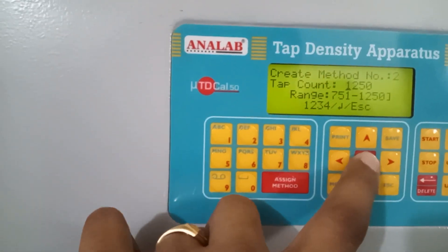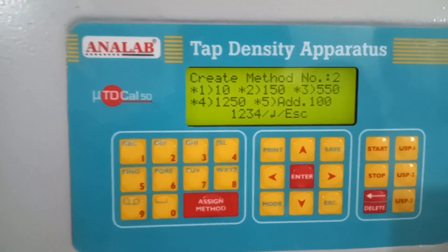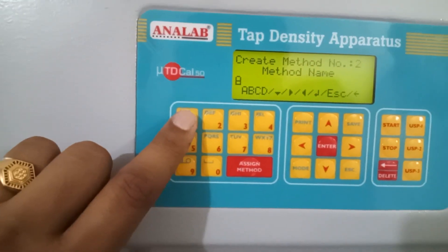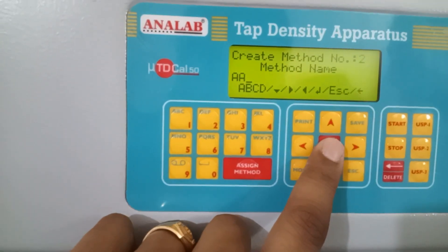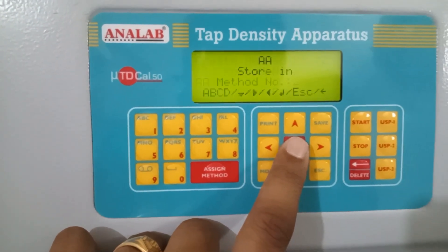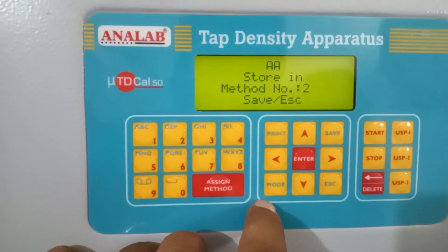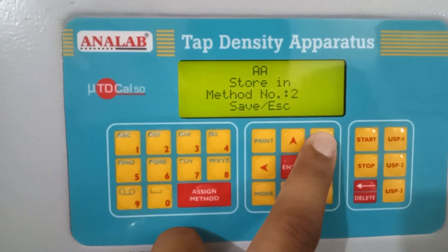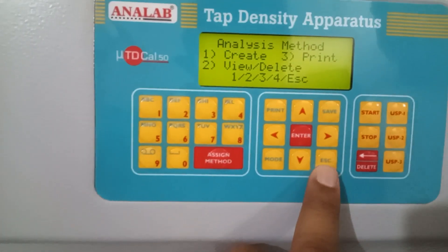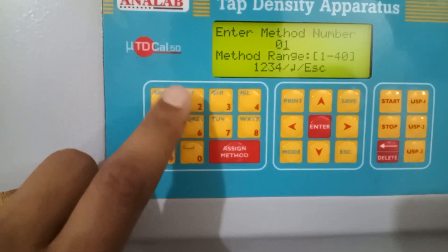I will also select the remaining four tab options. As you can see, the star marks indicate all the type options are selected. If I press enter now, then it will ask for the method name. I have written 'AA' as the method name — it can be an alphanumeric name. I will press enter. This will show the option available to save the method: the name of method stored in method number 2. If we need to save it, we can press enter. Now we will save the method. The instrument will come back and you can view the stored method. The method was stored in second number, so I will press 02 and press enter.